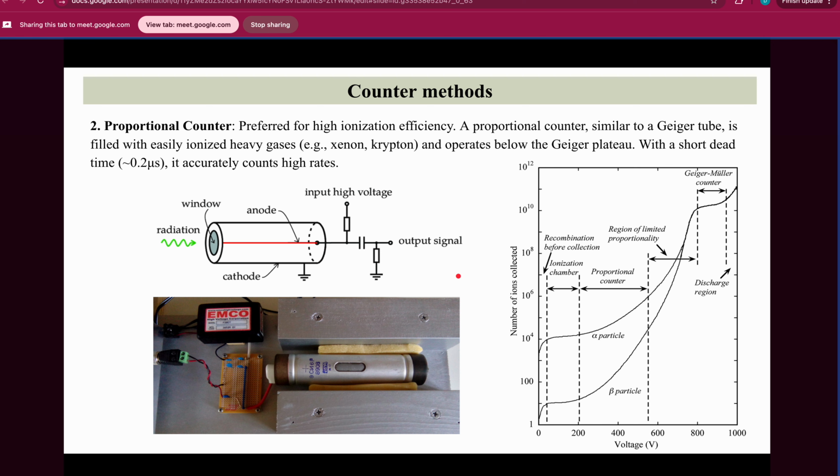That pulse will tell you the dosage of the X-ray radiations, because if the X-ray radiations are greater or of high intensity, then the pulse will be stronger, otherwise the pulse will be weaker. In that way they help to count the dosage, and this is how the proportional counter looks. These are just small cylindrical tubes.